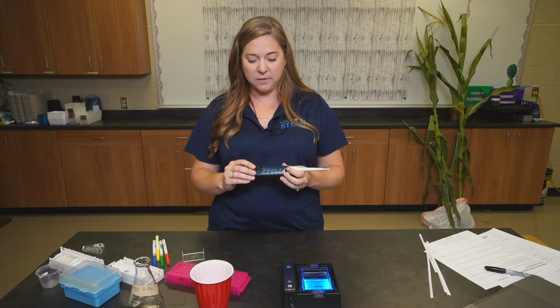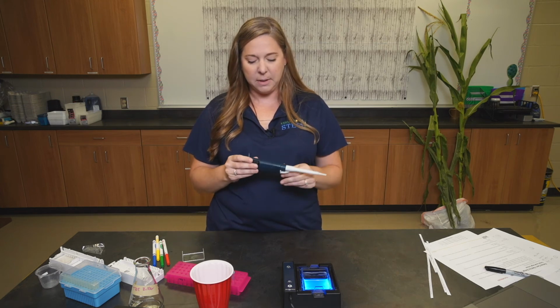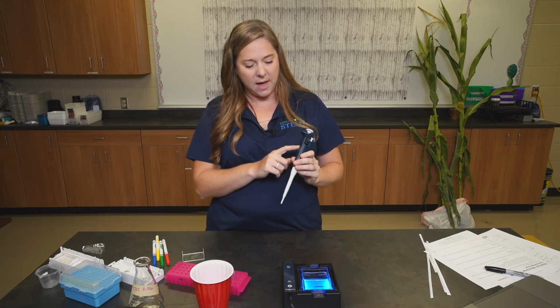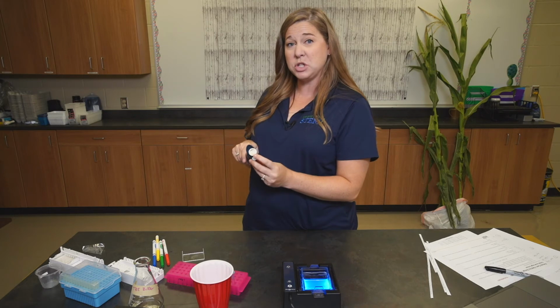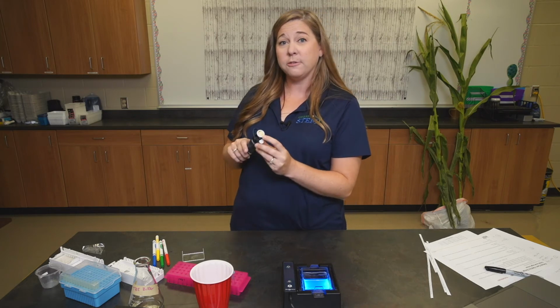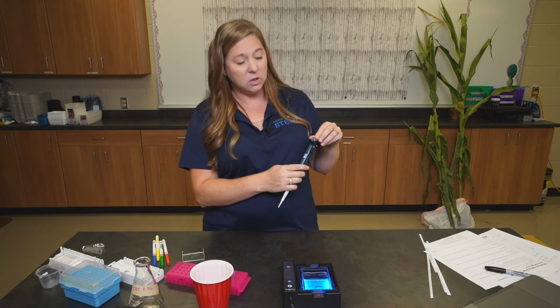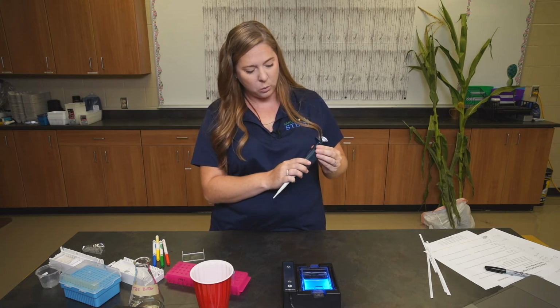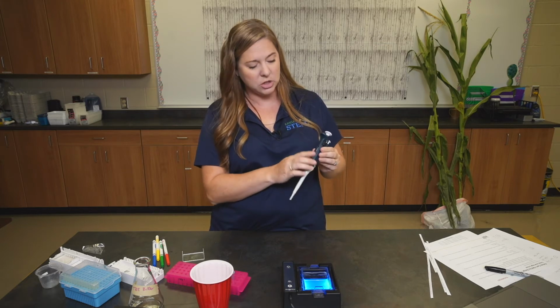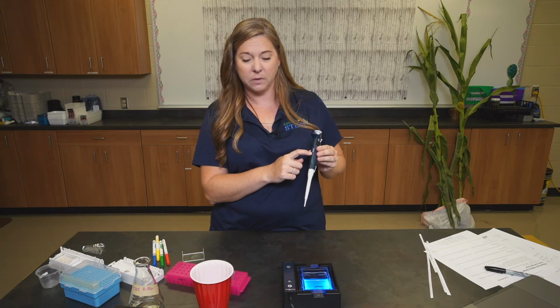The micropipetter that you get in the kit is going to look a little bit like this. It has an adjustable dial that has 3 numbers. The first 2 are black, the last one is red. This micropipetter goes from 2 to 20 microliters. For our lab today, we need 10 microliters. To adjust this, you can either twist the top knob or you can use the wheel here in the middle. We're looking for 10 microliters, so it should read 1, 0, and then another 0 in the red.